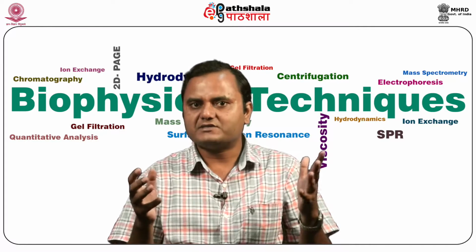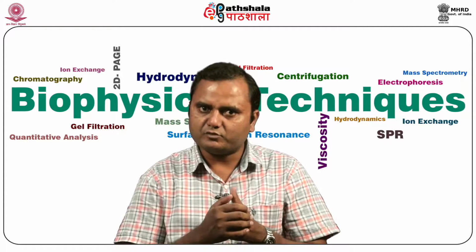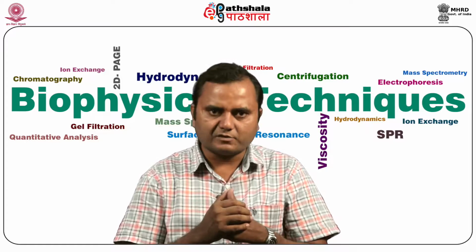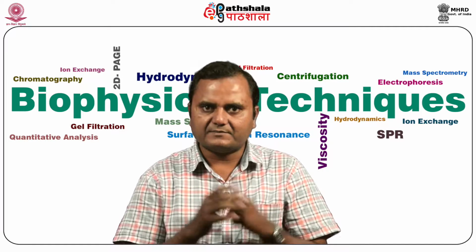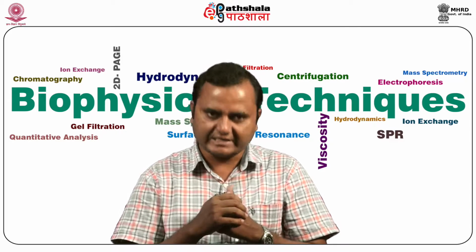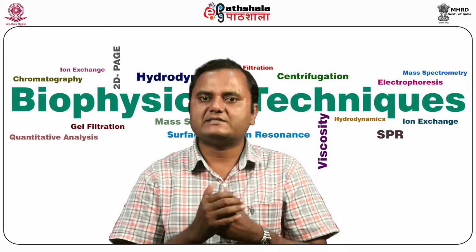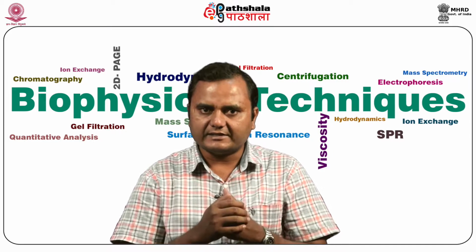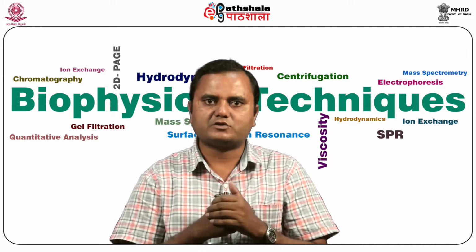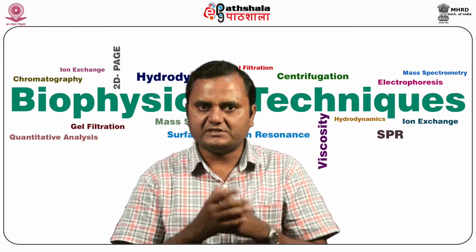But some molecules are devoid of such a property to absorb light. In that case, the Rayleigh interference optical system is used for the measurement of sample concentration, which is based on refractive index changes rather than absorbance. So it is used to analyze macromolecules lacking an intense chromophore, for example polysaccharides, and samples that contain a strongly absorbing buffer component such as ATP, GTP, DTT.